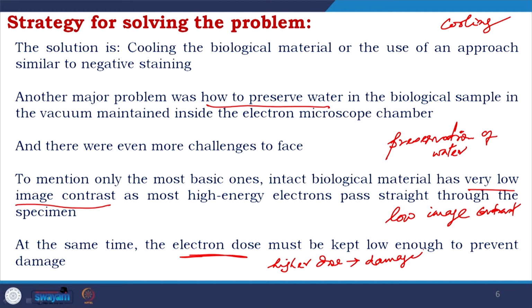Now, if you use a lower dose, the contrast, or signal to noise, is even worse.